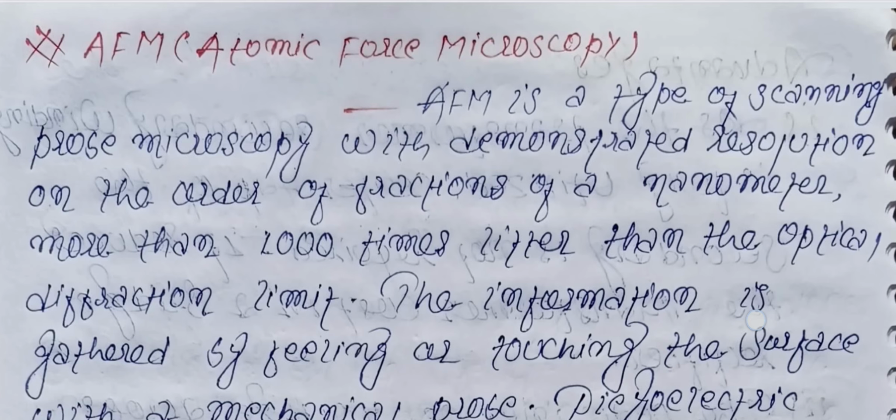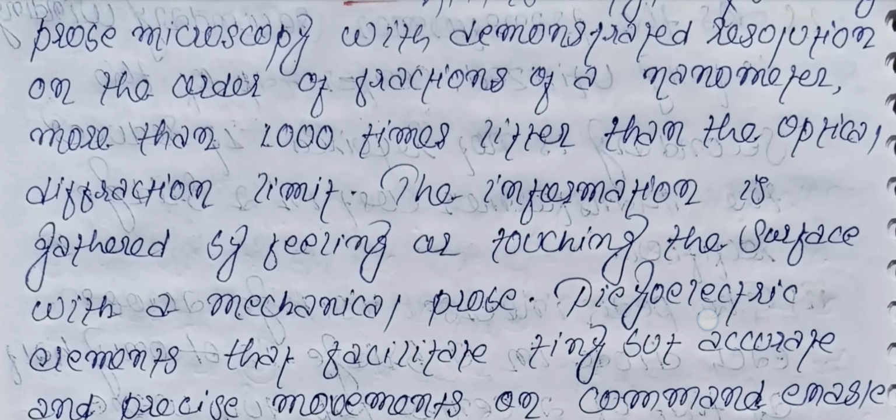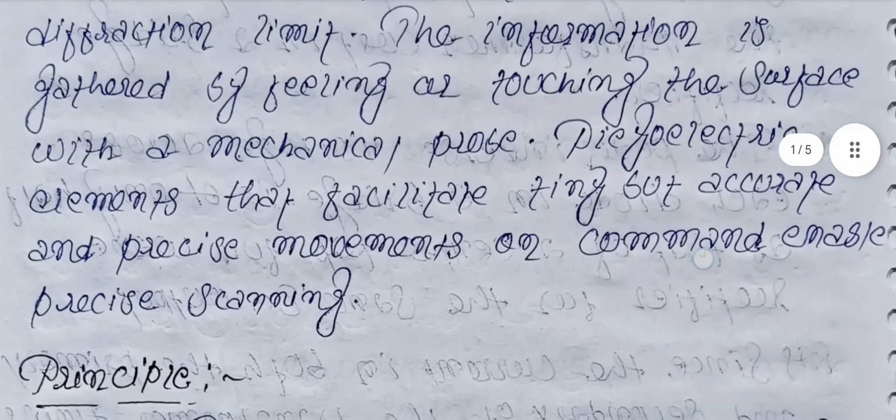The information is gathered by feeling or touching the surface with a mechanical probe. Piezoelectric elements that facilitate tiny but accurate and precise movements on command enable precise scanning.